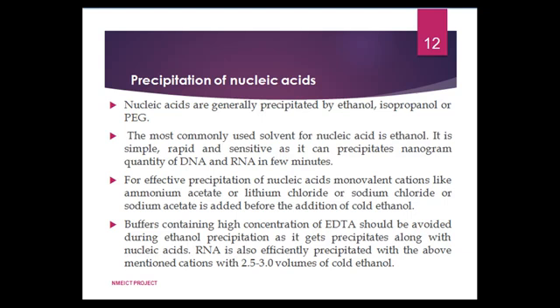For effective precipitation of nucleic acids, monovalent cations like ammonium acetate, lithium chloride, sodium chloride or sodium acetate are added before the addition of cold ethanol.